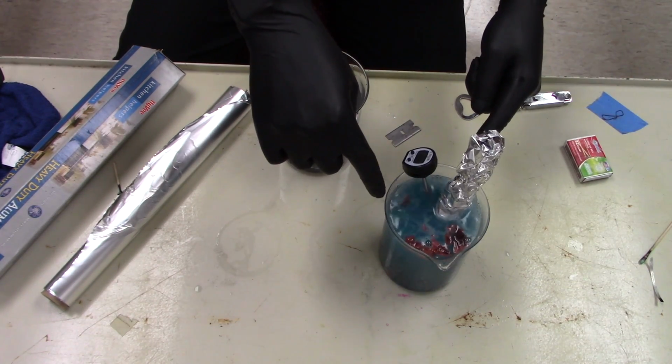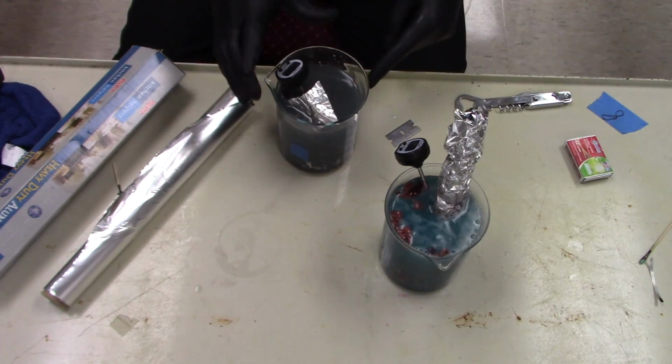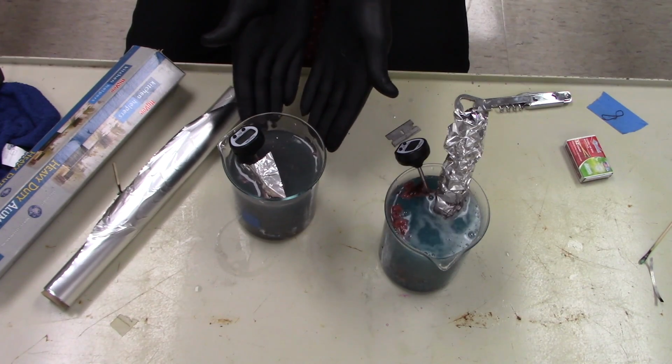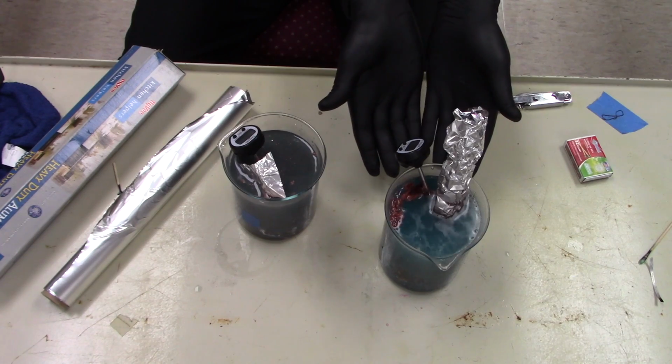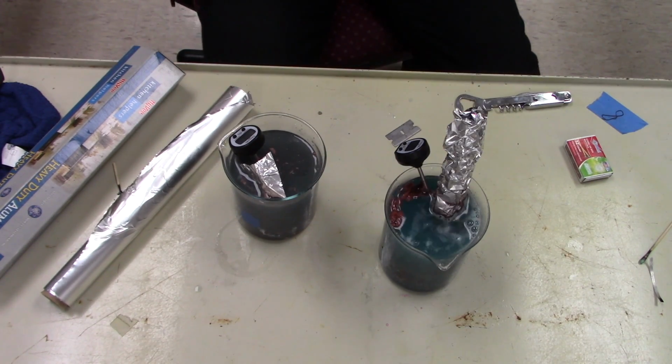So this one is already at 97 degrees. This is already sort of gotten to this point just about. This has been sitting here for over an hour. This has been in there for about 45 seconds. So those catalysts are really important in speeding up reactions.